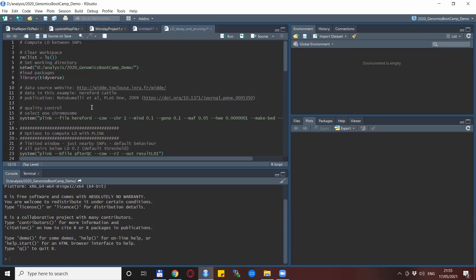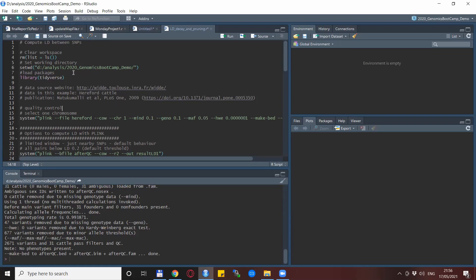For this particular exercise we do a simple quality control and take just chromosome 1. We load the tidyverse package that will be useful and necessary later on with the visualizations, and after the quality control we are left with 2,671 variants and 31 cattle.